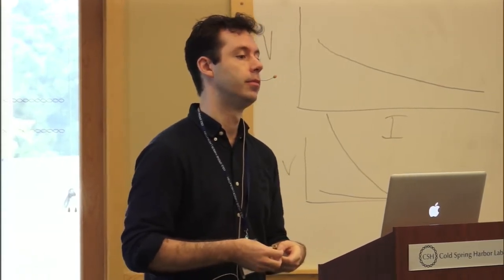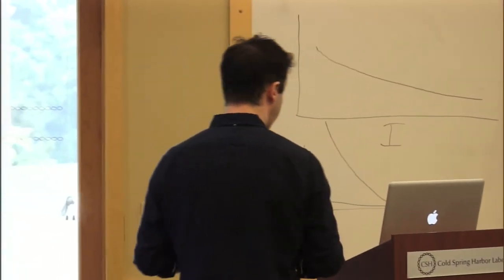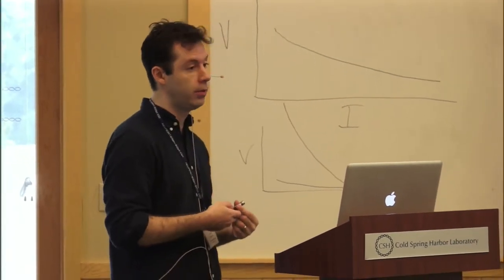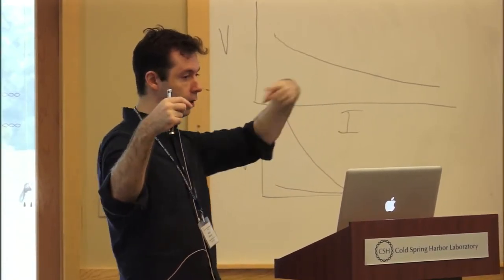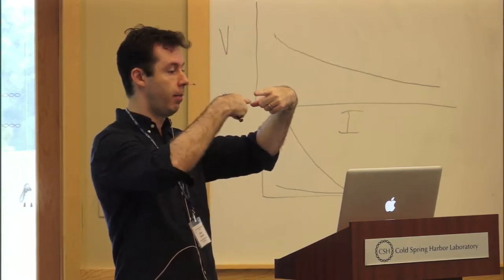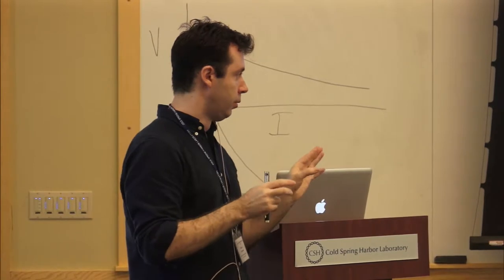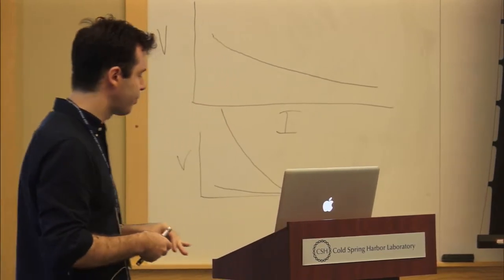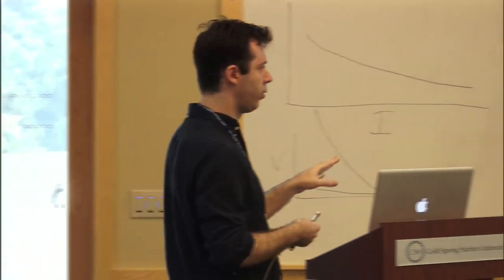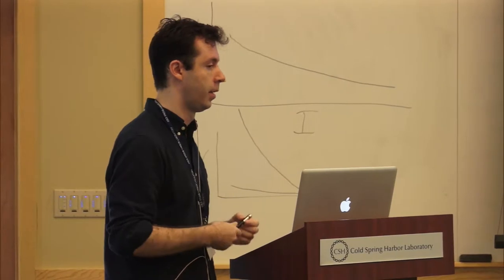Yeah. What's the longest fragment you can sequence with this? So the longest fragment that you can now sequence using Illumina sequencing is 250 nucleotides per end. Meaning you have a DNA fragment, you sequence 250 nucleotides in one direction and 250 in the other direction. It basically allows you to sequence pretty much 500 base pair pieces of DNA. This is the maximum that Illumina is giving you now. This is an incarnation of the technology that's not so much used on the HiSeq 2000 or HiSeq 2500, but on the MiSeq, this is something that is used all the time. This 250 paired-end length.